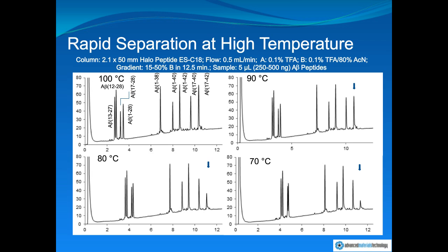And this is important for two reasons. One is we find increasingly that operation at elevated temperature, really above 70 degrees, is quite important, not just for somewhat specialized, badly behaved peptides like the amyloids are, but also this is the case for many protein separations in order to get full recovery, that is full elution and recovery of either your peptide or protein.